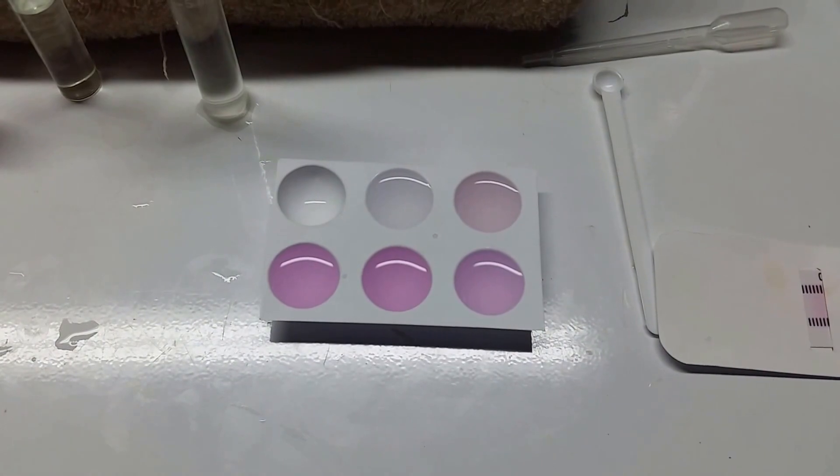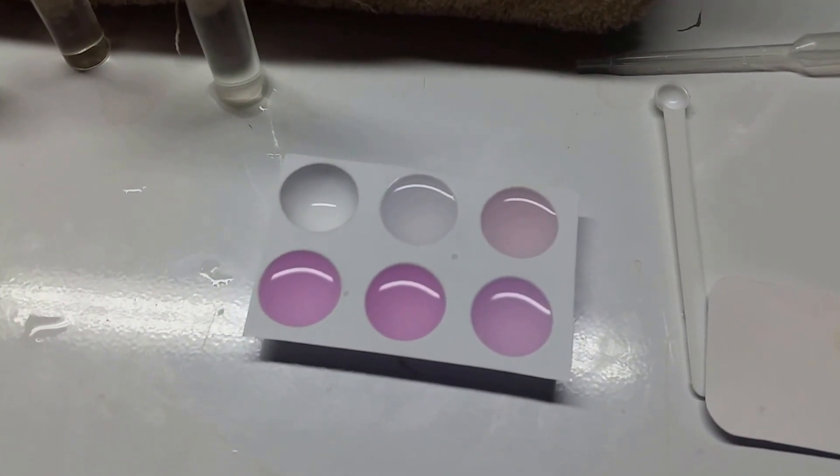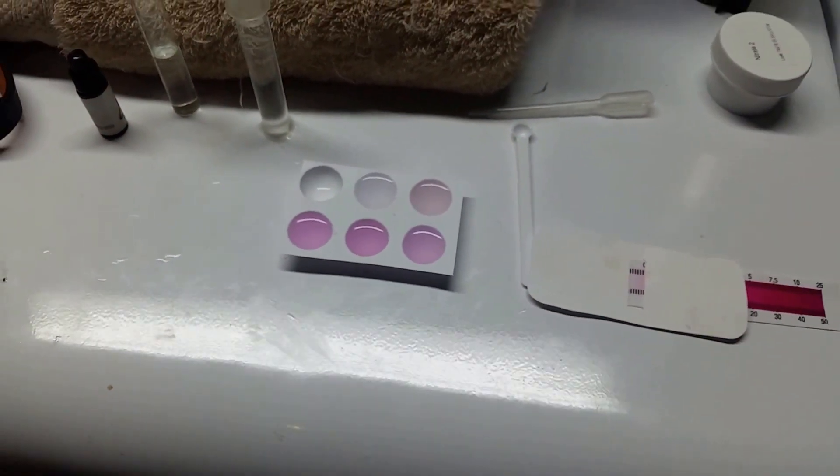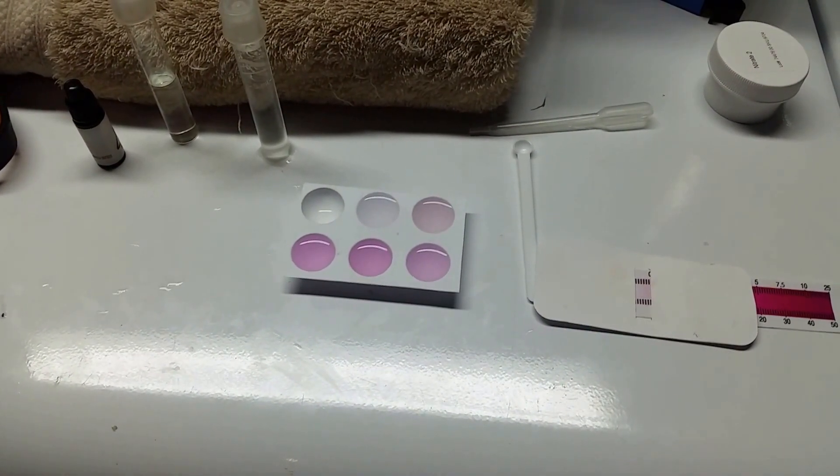My control tests confirm that everything is working as it should. So I'm still getting nitrites building up little by little, but we're getting there and I'm going to keep on top of it.